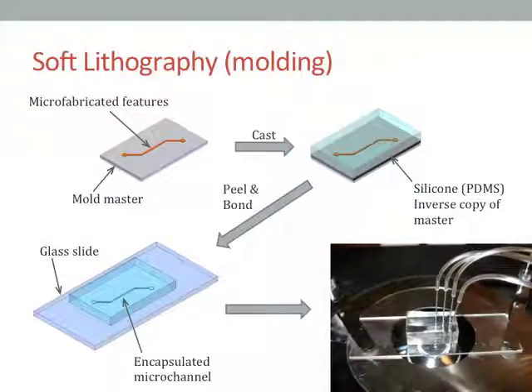What soft lithography actually is, is a really simple implementation of a very old technology called molding. So first you create the structure. You create microstructures like this, whichever method, but let's say you use integrated circuit fabrication to create a structure. Then you pour soft silicone over this structure. You let the silicone cure, and it hardens into a gel. Now you can peel the silicone off, and you can bond it to something else. And so what you've done is you replicated this original structure.